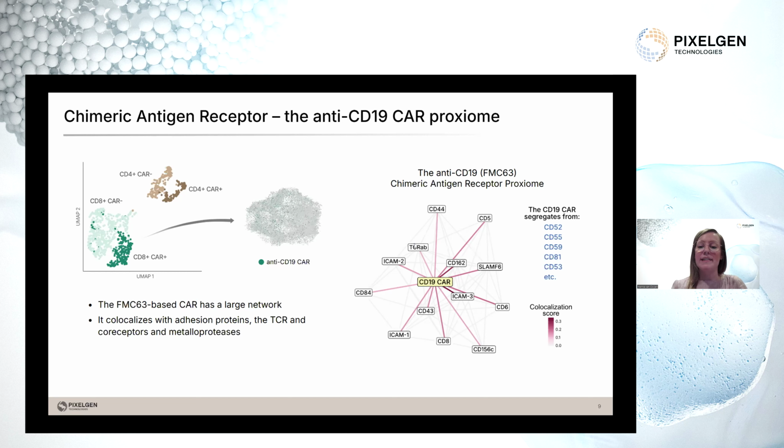On the other hand, the TCR is also in steady state colocalizing with these tetraspanins, and tetraspanins are really important for regulating organization, and they also play a role in synapse formation, etc. Whereas the CAR receptor is not at all colocalizing with these tetraspanins, possibly explaining differences in the CAR synapse where you don't really get these traditional ring structures, but more puncti, etc. So it could be a kind of differential regulation depending on which proteins it's interacting with.